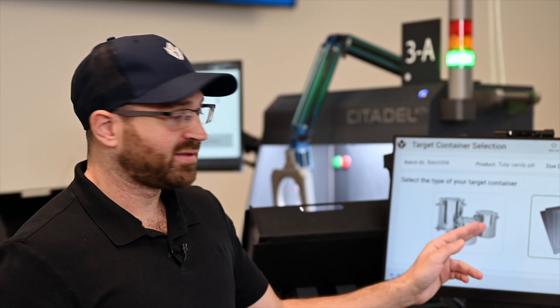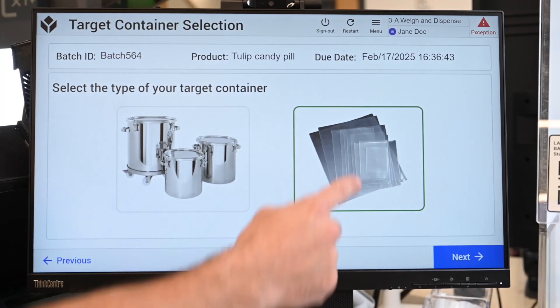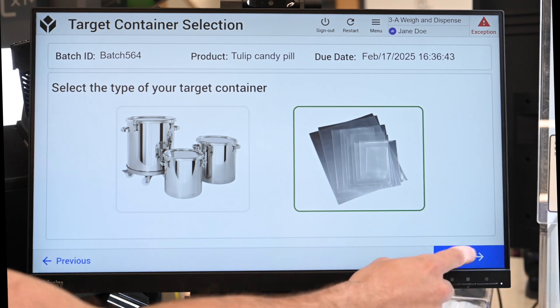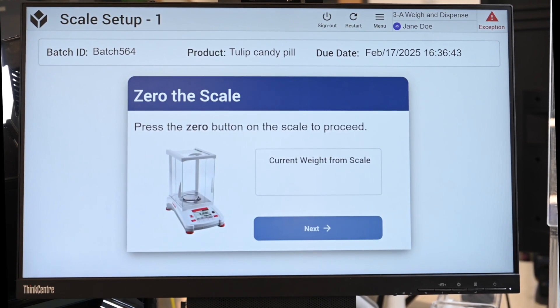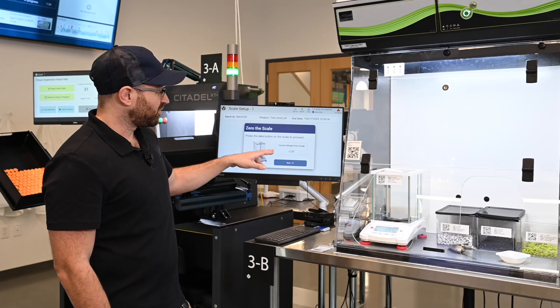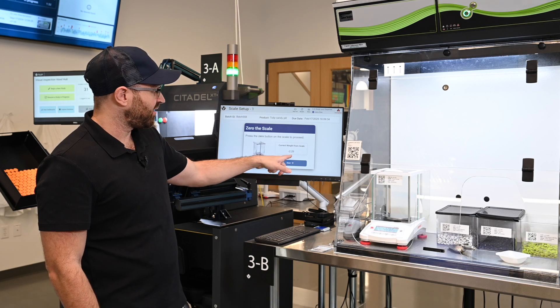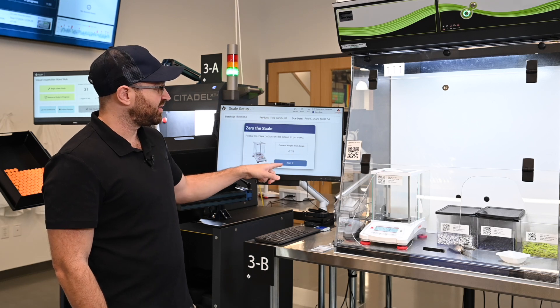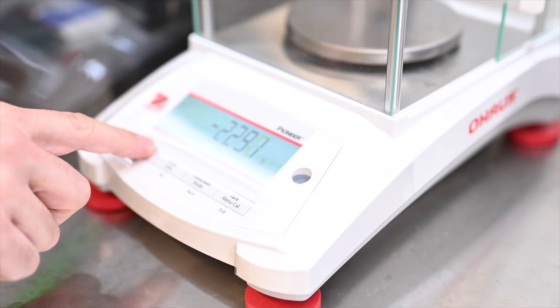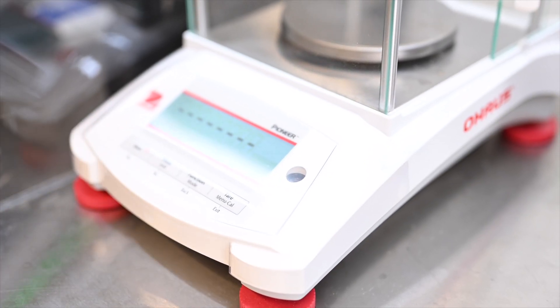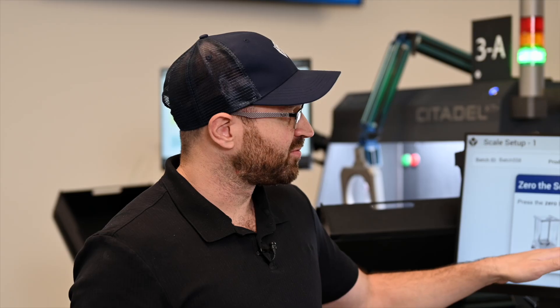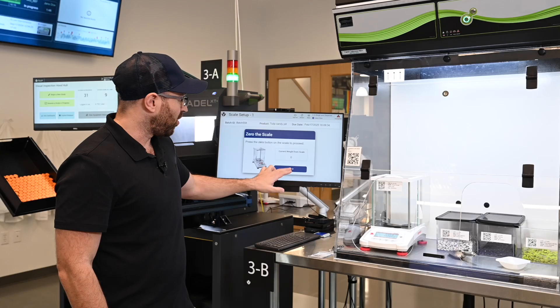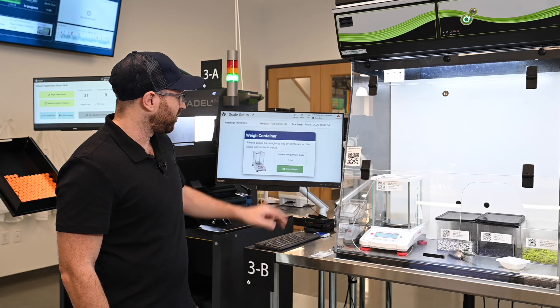Now I'm going to select the container that I'm going to use, which is this one. And I have to zero the scale so I can begin weighing. Tulip is reading values directly from the scale and won't let me proceed until I zero the scale. Now that it's zeroed, it's actually guiding the operator through this workflow. It's really important that we zero this because it could cause all kinds of issues, so only now can I move forward.